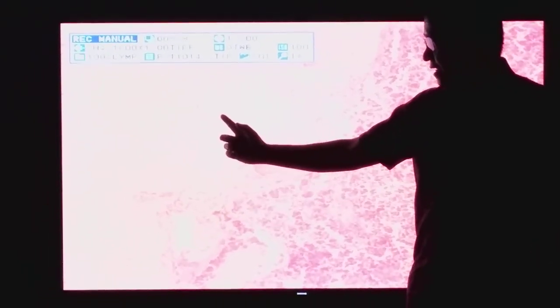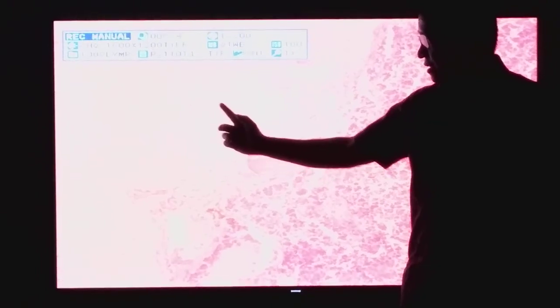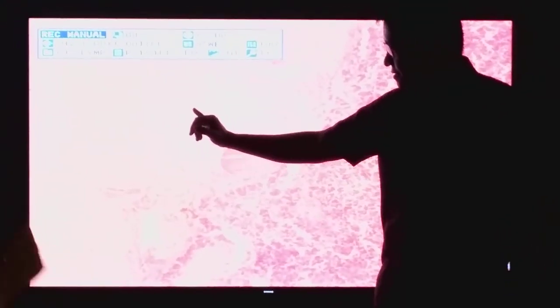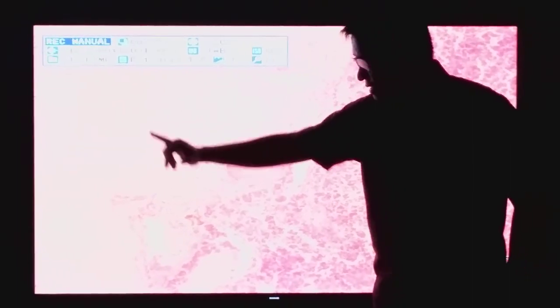What we will be able to see, however, are the supporting cells. These are nuclei of one population of cells which are also present in the central nervous system. How do you call these cells? Pituicytes. Glial cells. Very good. Glial cells. So they do not produce hormones. They are there to support the axons of what two neurons?